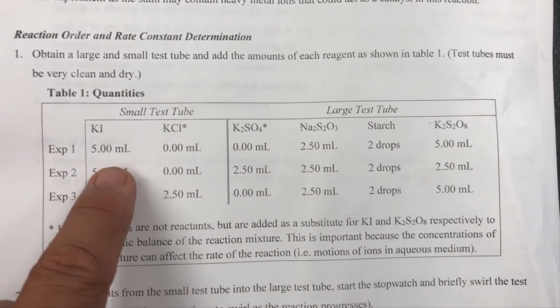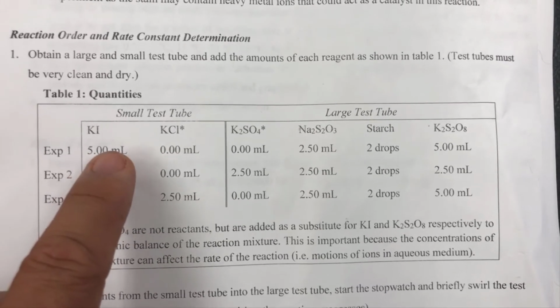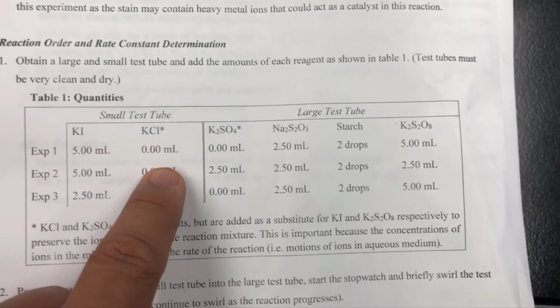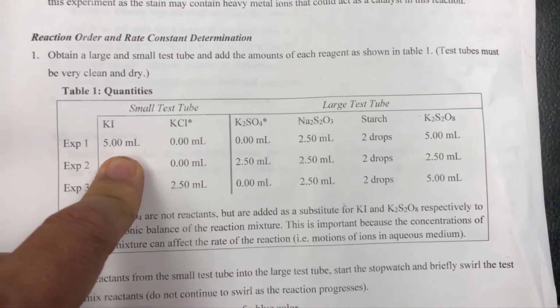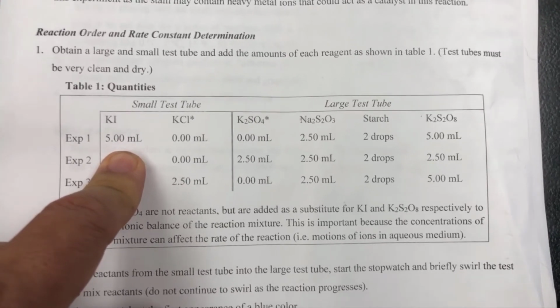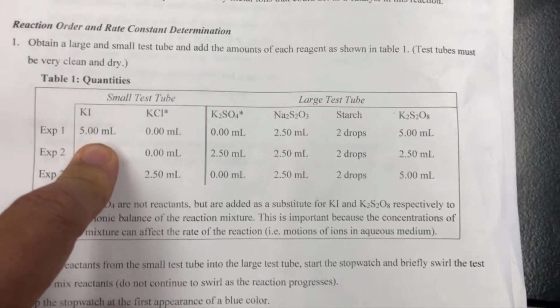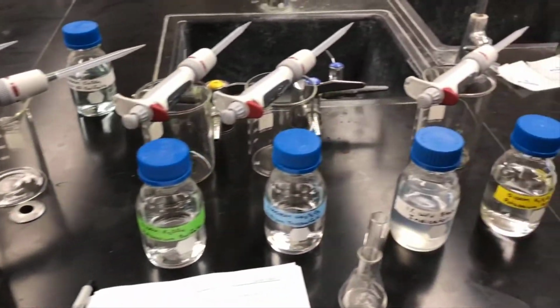So what we're going to do in this video experiment is go ahead and set up these volumes. Now I'll show you what I did, and I always try to emphasize this in my videos because I'm working alone and you have to be super organized. But this is kind of true in any sort of research endeavor as well. I set it all up. This is actually the table in front of you.